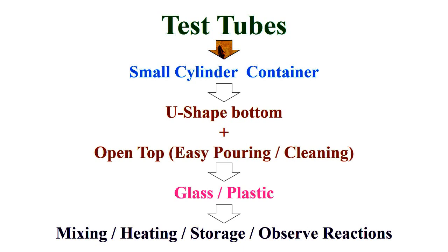Test tubes are small cylindrical containers with a U-shaped bottom and open top for easy pouring and cleaning, made of glass and plastic, used for mixing, heating, storage, and observing reactions, as mentioned in the next slide.